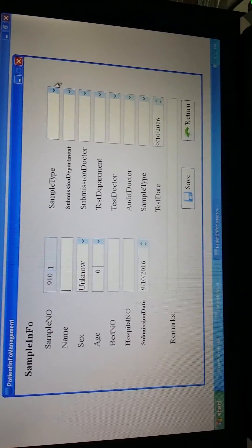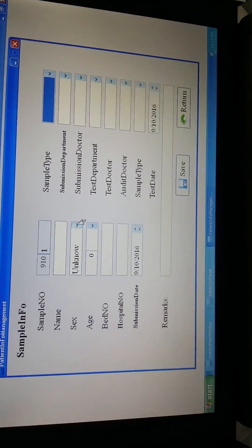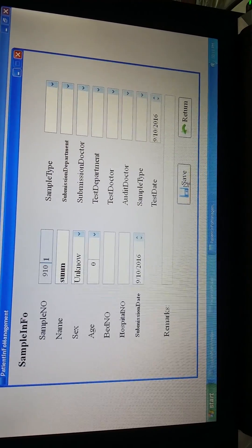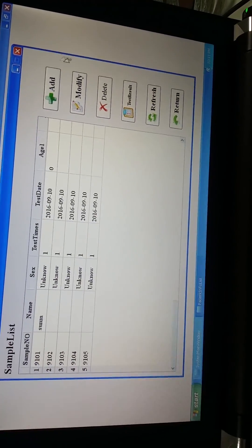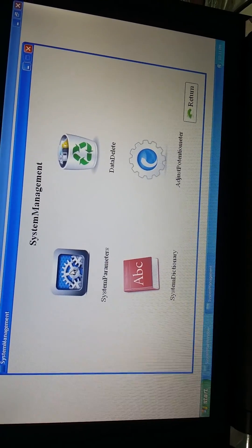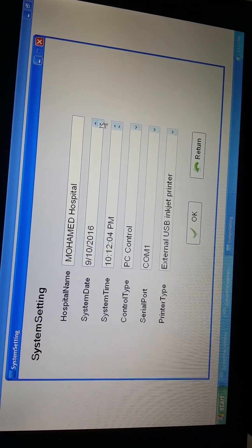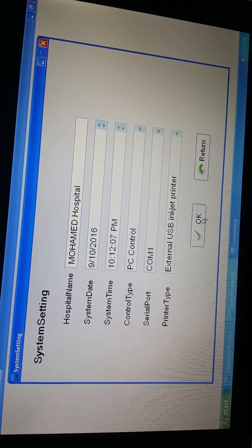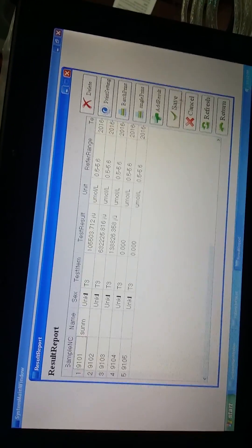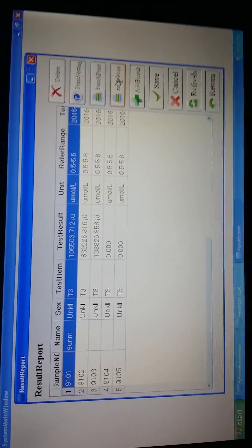If you want to add the hospital name, press system settings, then system parameters, and from here you can enter your hospital name and the system date. Then press OK. After you do this, you can print out the reports as you want. That's all, thank you.